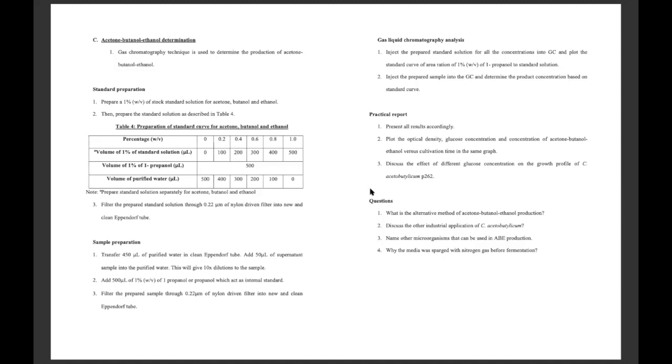How many standards do you need to prepare, guys? Three, right? Three different standards. You need a standard for acetone, a standard for ethanol, and a standard for butanol as well.